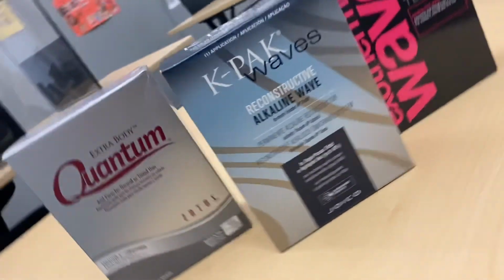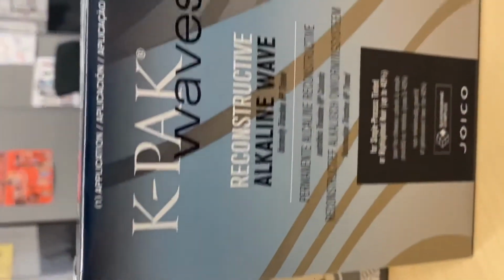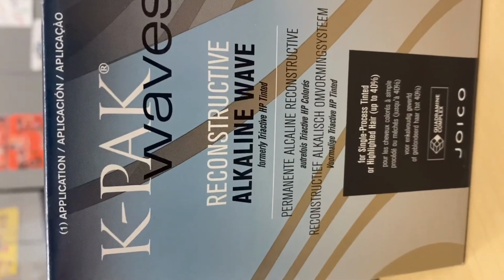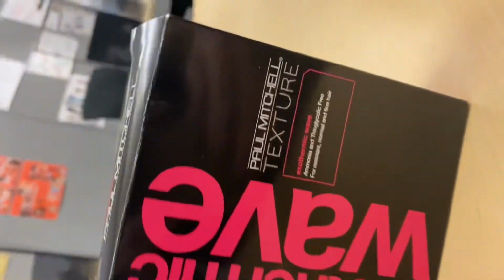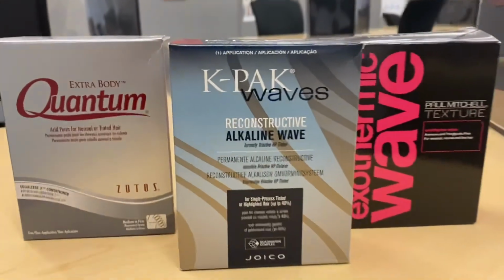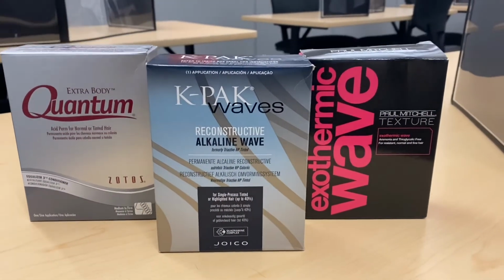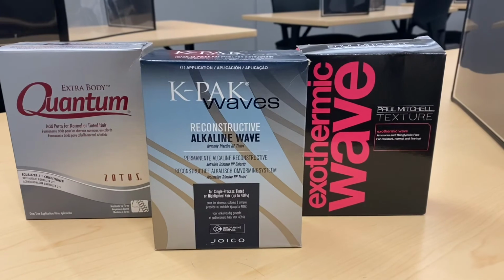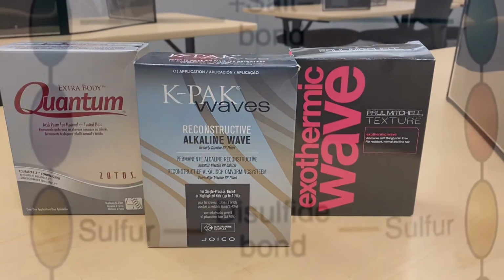So our first one is going to be an acid perm. We're going to experiment with an alkaline perm, and we're also going to try an exothermic perm. So we will be using these according to manufacturer's directions for a test strand, and then seeing what the hair looks like, color treated and non-color treated, with the effects of the permanent waving solution on our strands.